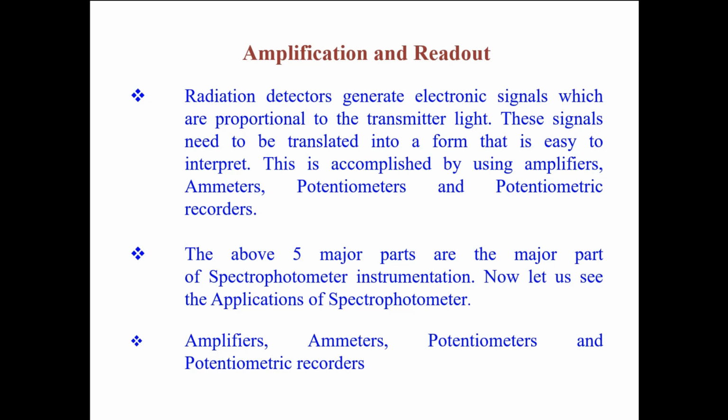When they reach the anode, and the anode is connected to the circuit, you will know the amount of electricity generated from these molecules, from the light absorbed. Okay, so that is directly proportional to the amount of photon energy released from the sample. Then we call it optical density, or even transmittance, whatever it is, but you can measure that.